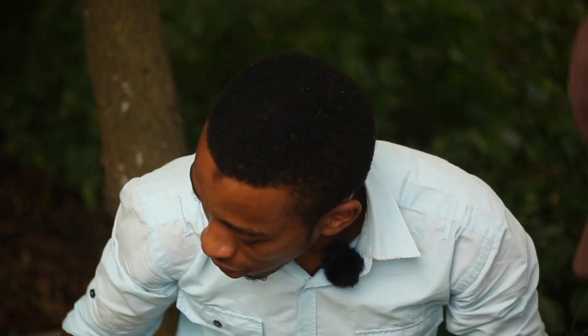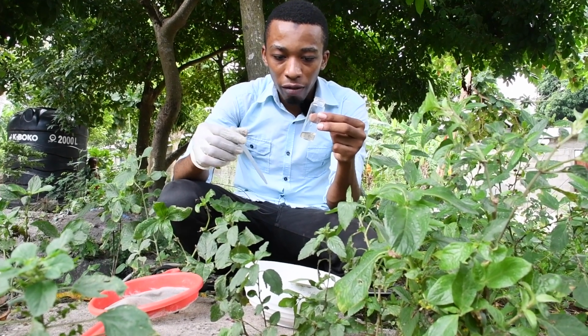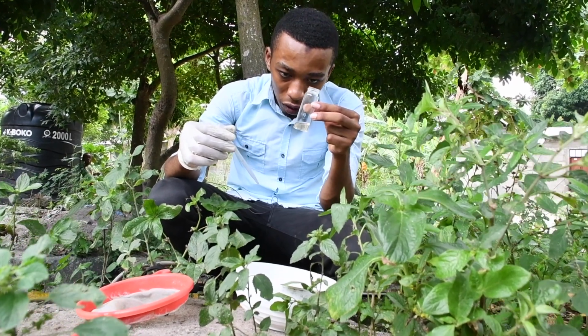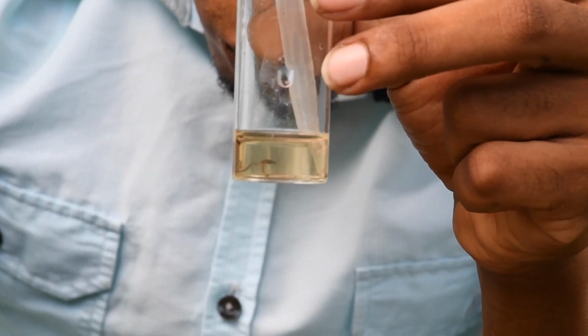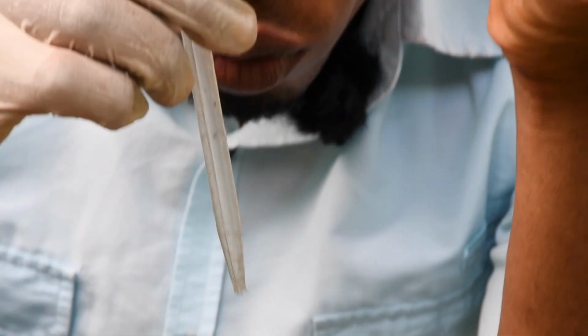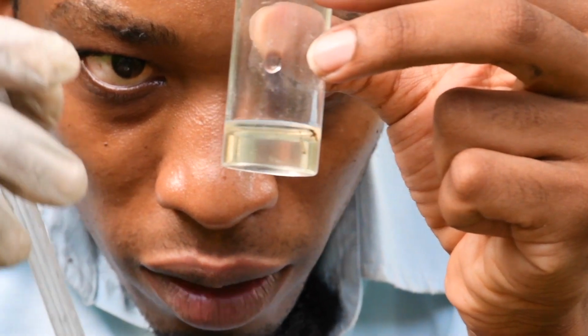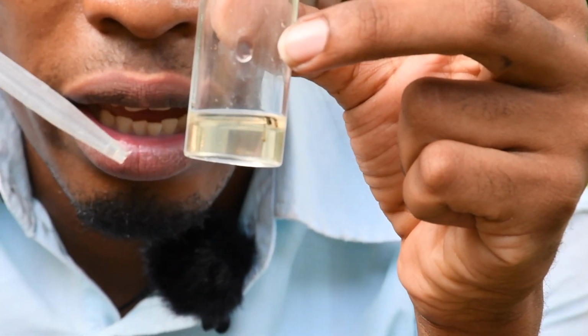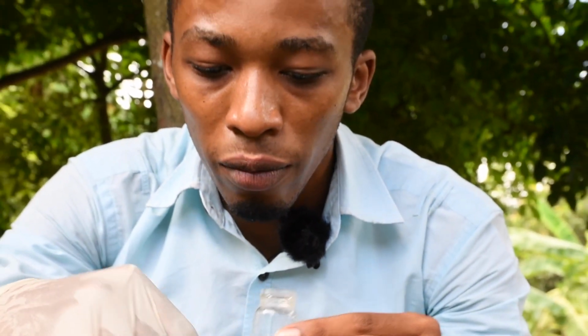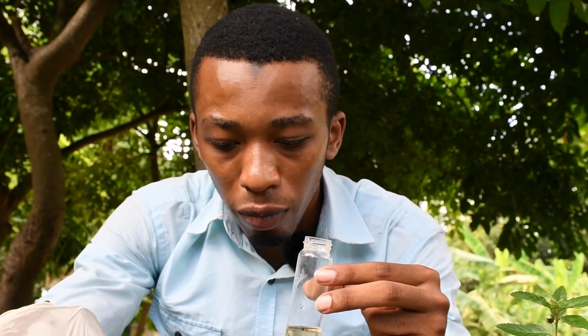species. Okay. So once we've stored the larvae in the vial, it's imperative that we make sure there are no predatory species that might attack or eat our mosquito larvae. So we have our vial that is only filled with mosquito larvae and pupa, and nothing else that might lead to harm to the collected samples.